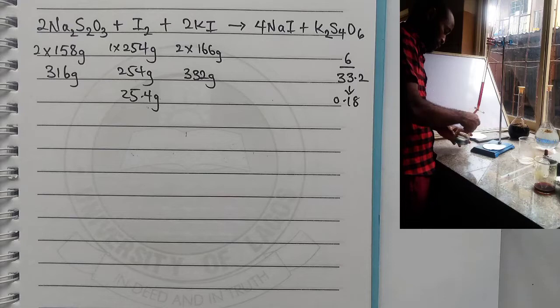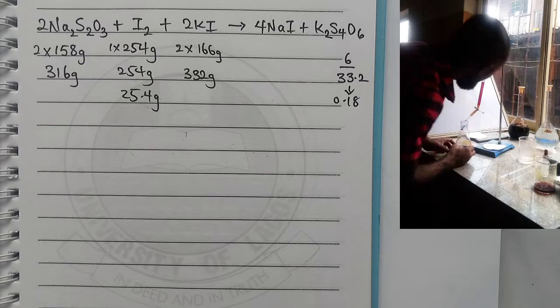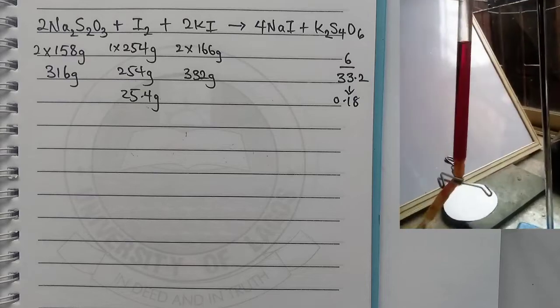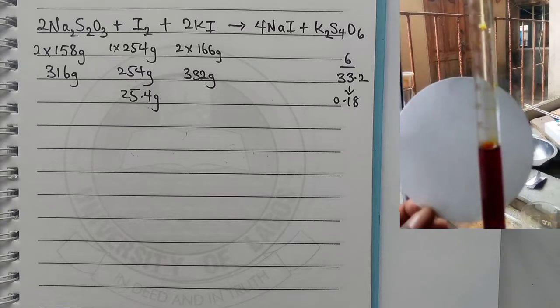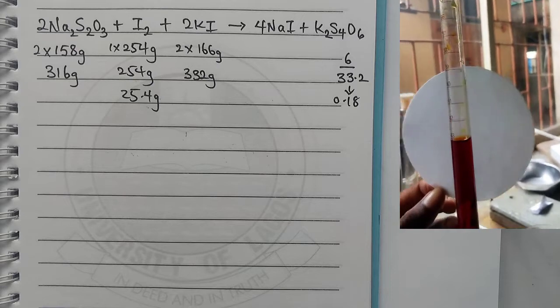Therefore, if you are a teacher watching this, it's an opportunity for you to go home immediately and come to school on Monday or early Tuesday and grind your iodine and make sure that you are able to get a value that is close to mine. The first one I did, I had 54. The second one I did, I had 50. Then I changed the pattern, used the pattern that I used in this video, and I had 47.